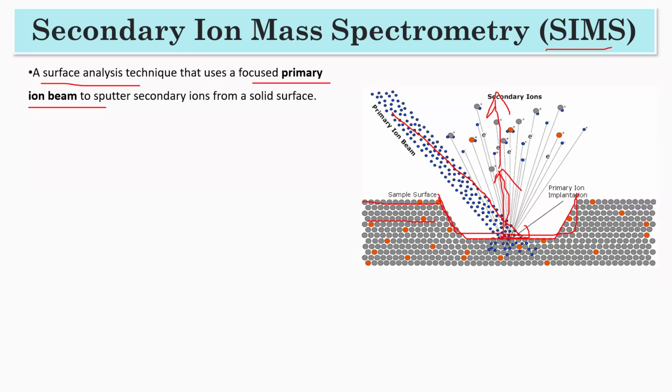So you can just use this method, and directly use your sample on that substrate, hit it with the primary ion beam, and your mass spectrometer will analyze the sample and tell you what peaks are coming. Then you can understand, using some online software like MassBank and others, what kind of organic molecule is present or not. Okay.